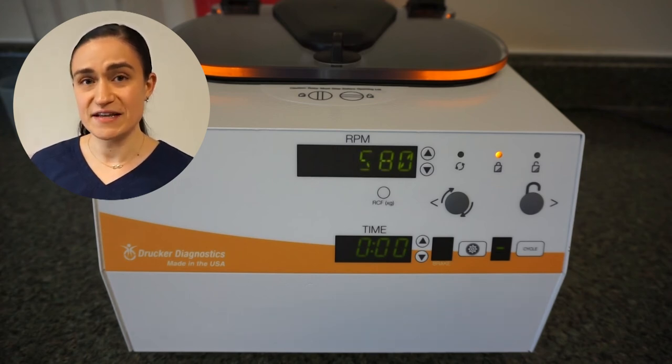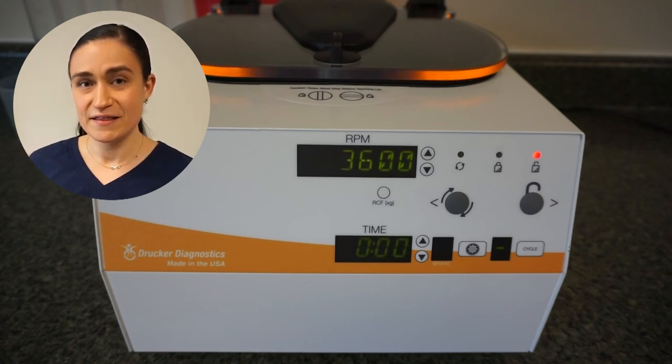Once it finishes spinning, the centrifuge will beep and flash to let you know it's done. The lid latch will unlock for 60 seconds after the rotor comes to a full and complete stop — keep in mind you cannot open the lid until the rotor has completely stopped, as this is a safety measure. If the centrifuge lid locks again, press the stop/unlock button to unlock it. The centrifuge will automatically maintain your last-used settings, so if you want to run the same cycle again, just switch out your tubes and press start. Congratulations — you just spun your first tubes in your SARA-12.